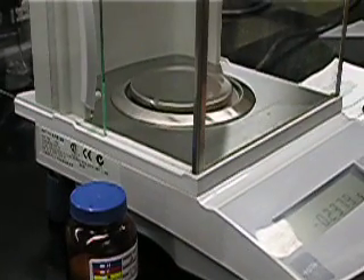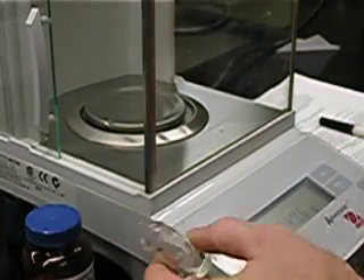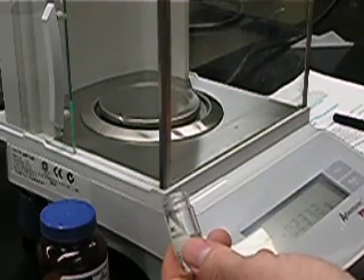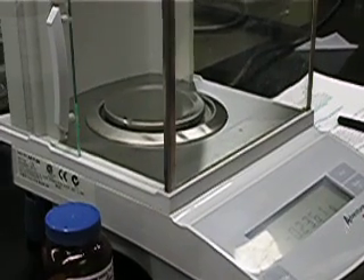A very common technique is simply the weighing of a solid using weigh paper, an analytical balance, and some glassware that you're going to be transferring the solid to. Today we'll be weighing out 0.05 grams of celite.